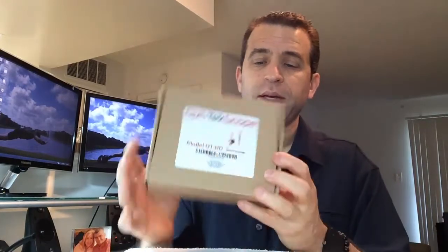We're going to do an unboxing and I will connect the software to my computer and then we will put it to the test. By the way, any questions, anything that you need, Matt, the owner of the product, will be happy to answer those questions for you. He's great. I've been communicating with him and really looking forward to giving him some feedback.